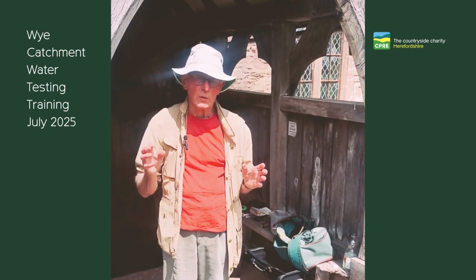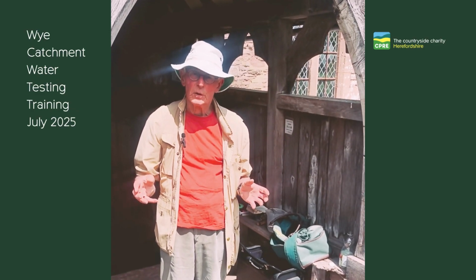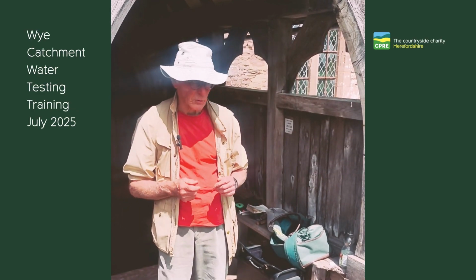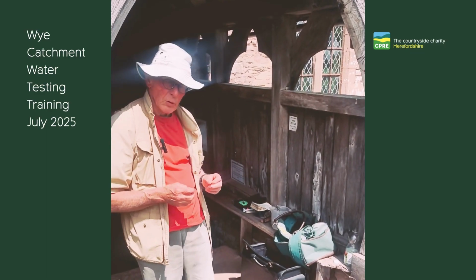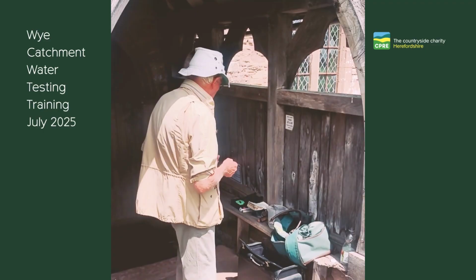I should add that almost always the water is clear, and that's especially so at the moment because we've had no rain for quite a long time. So turbidity is as simple as that. It's simply an observational thing.